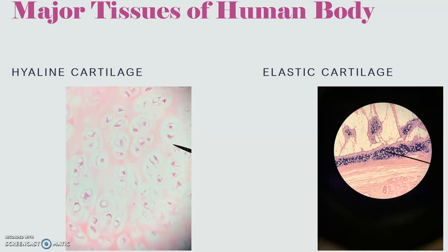You can see that the elastic cartilage is going to have those dark stringy fibers that you see. Those are elastic fibers that are going to allow this structure elasticity and stretchability. So that's what you see there, the elastic cartilage found in two locations: the ear, E, elastic ear, and the epiglottis, elastic epiglottis, E.